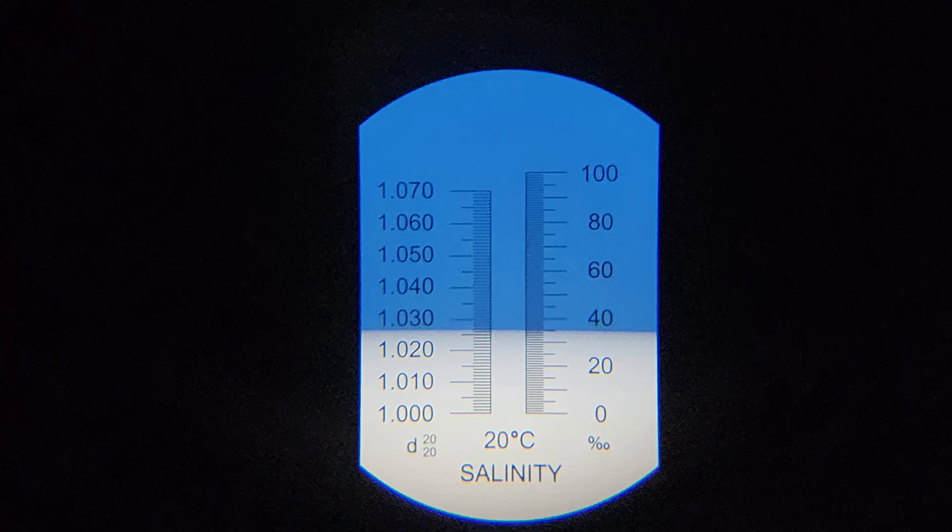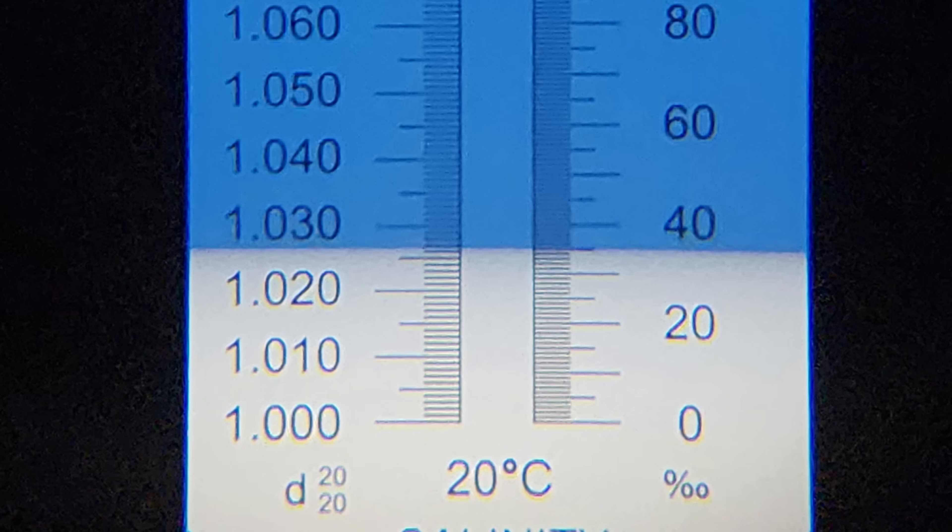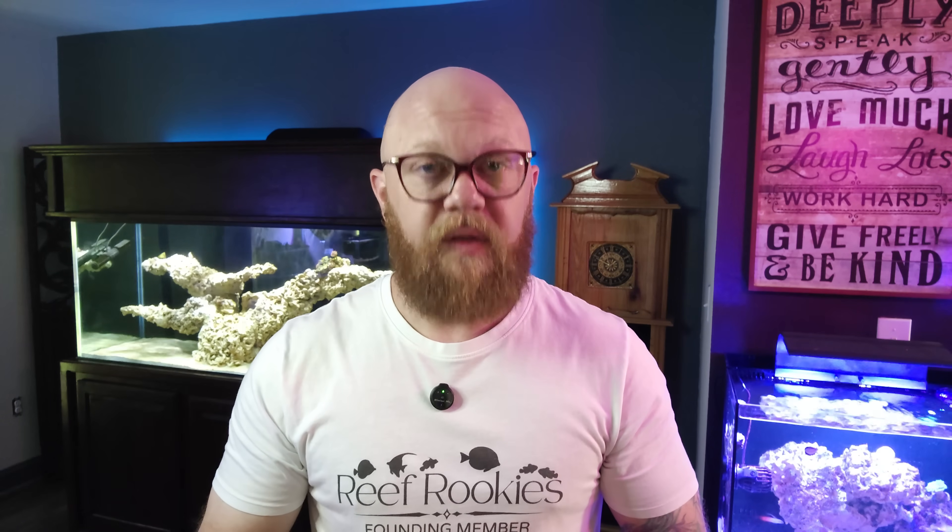Once you have done all of that and you're ready to calibrate, you're going to peer through the eyepiece and correct the focus so you can see the numbers clearly. If the break line — the difference between the blue and white — is not at 35 PPT or wherever your calibration fluid says it should be, you use the little screwdriver that comes with it and turn the screw on the front of the device to move that line up or down to where it needs to be. Then your refractometer is calibrated. It's also very important to keep it clean — wipe the salt water off with a clean cloth, then use a cloth with RODI water to clean it well, then dry it before you store it.